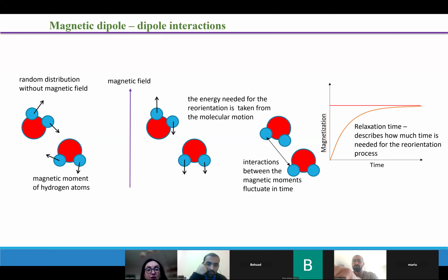You even had some small amounts of iron powder and its orientation in a magnetic field. All those stories, as I said, high school exercises. However, one can say it again in this way. The magnetic moments of protons interact with each other in the same way as they interact with the external magnetic field.